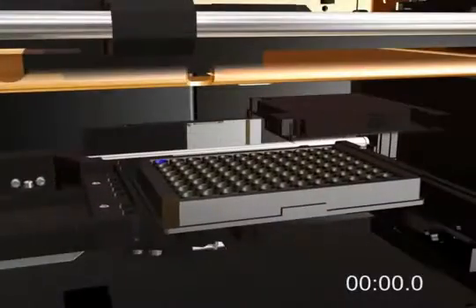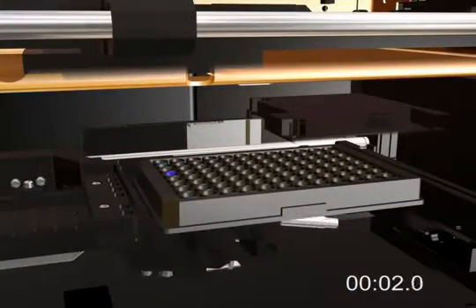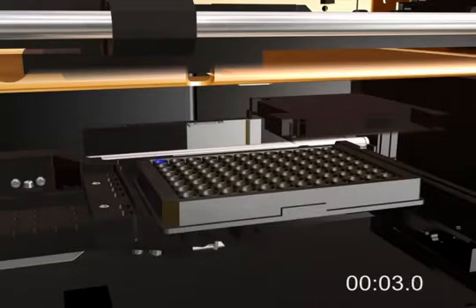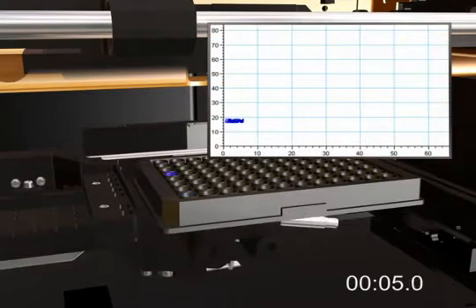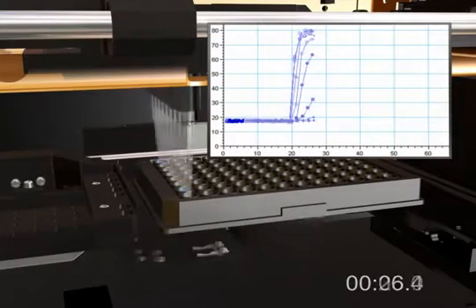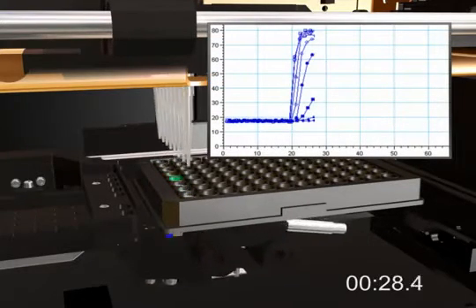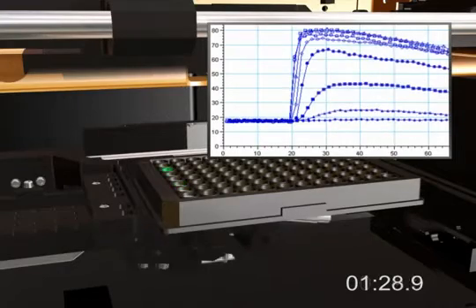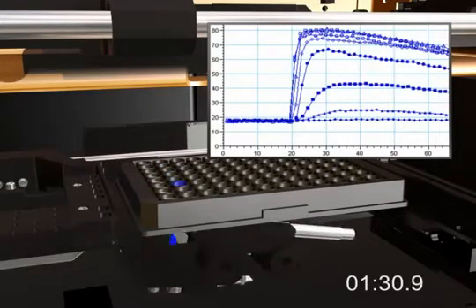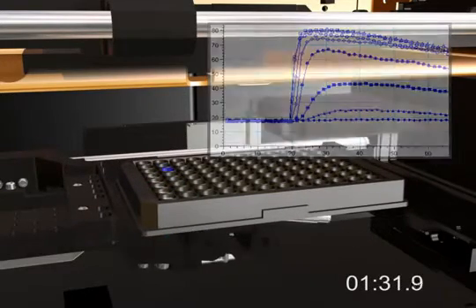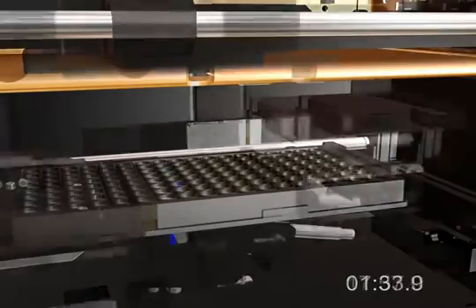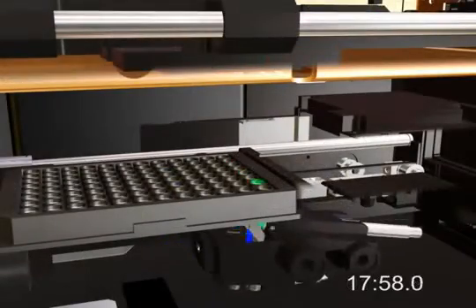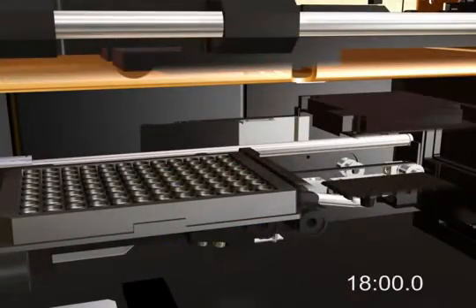Adjusting the kinetic intervals and timing for your assay gives you optimal results, which can be viewed in real-time as the plate is read. With FlexRead, an entire column's worth of data is generated at a time. Data is then analyzed using a Softmax Pro software protocol.